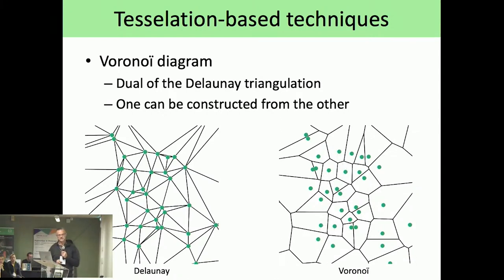Typically, you have the density, which we can define at a different scale. We didn't really explore that, but I'm sure there are many things behind that we could explore. But we can say, okay, let's take this molecule, so we can define the density by the number of molecules, which is one, by the area here, or I can take the surrounding molecules to define another area at the second scale around the molecule, and so on and so forth.